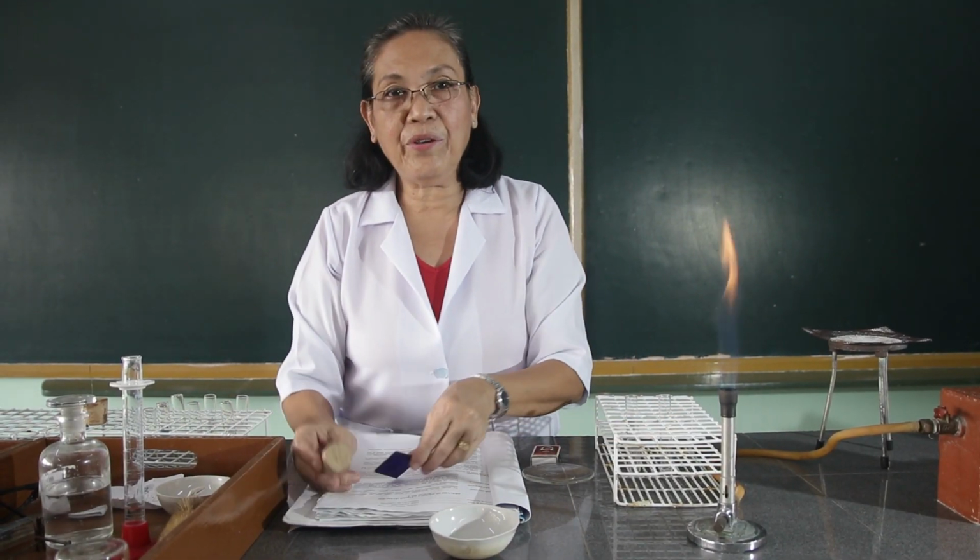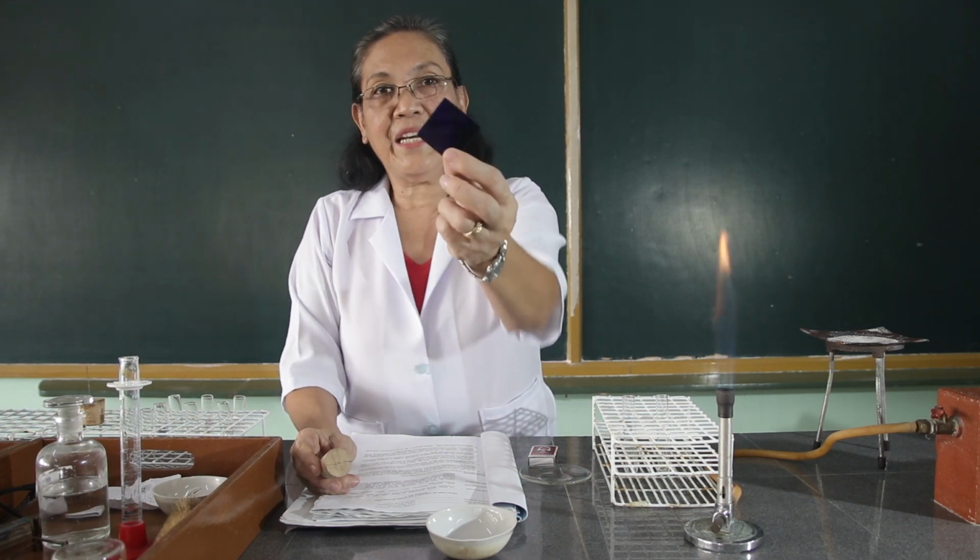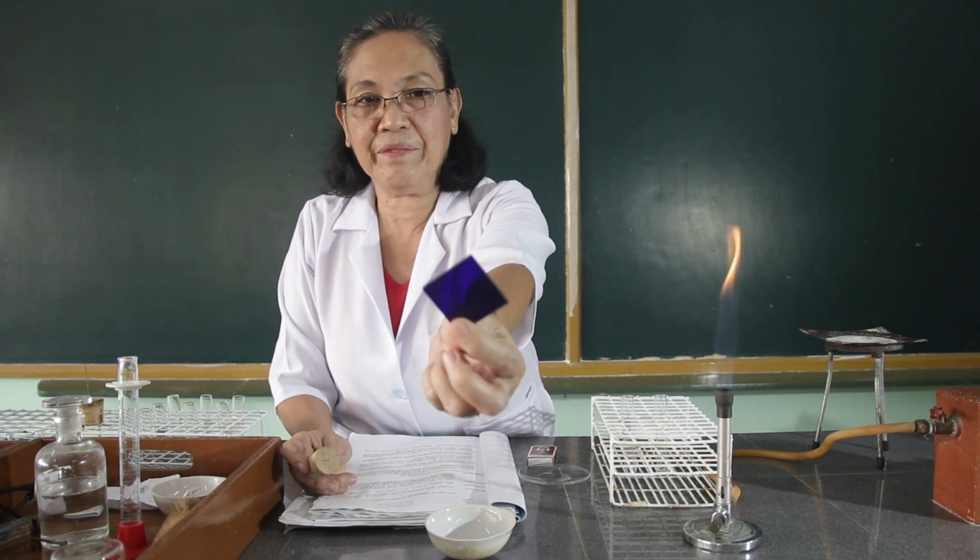And I want you to use the cobalt glass. Let's place this in front of the camera. Try to observe which color is clear when viewed using the cobalt glass.